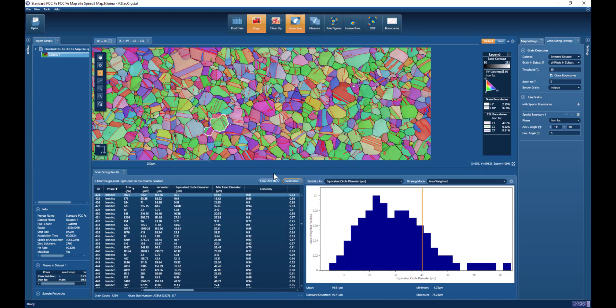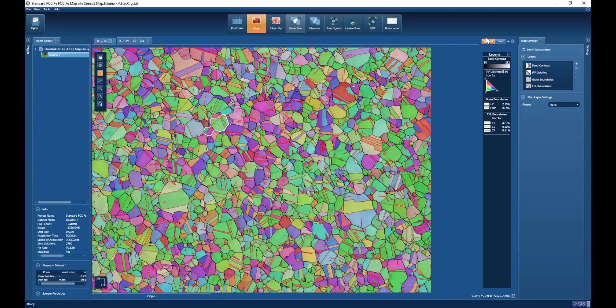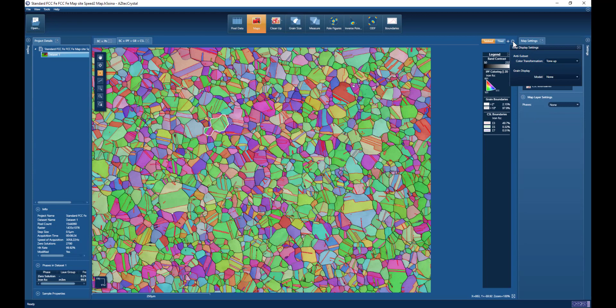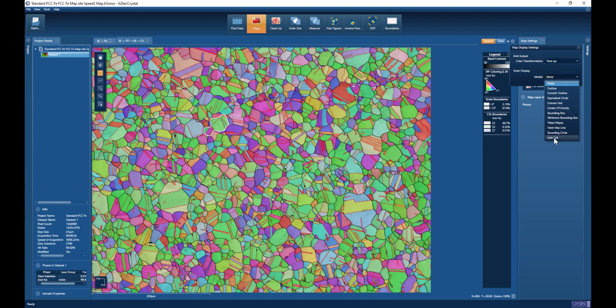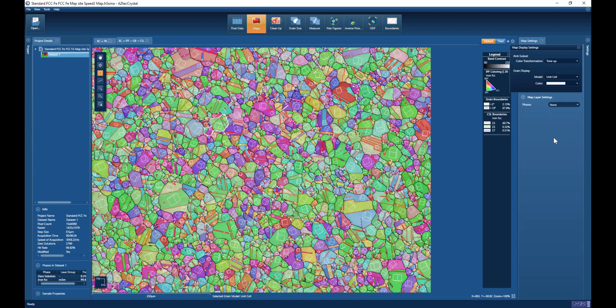We have more ways in which we can display the data. These would be displayed by choosing the grain display from the map display settings. We can even display the unit cell orientation for all of the individual grains as picked out in the software.